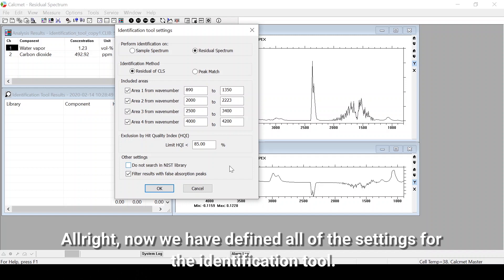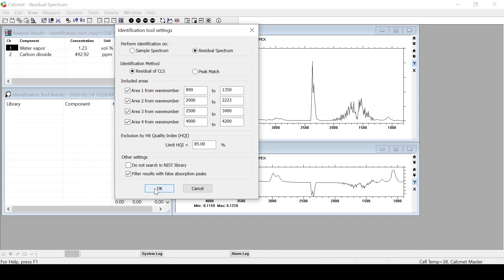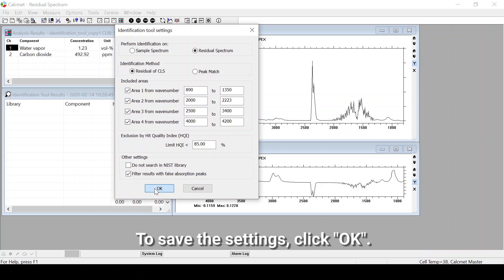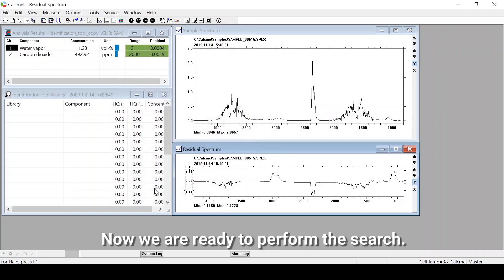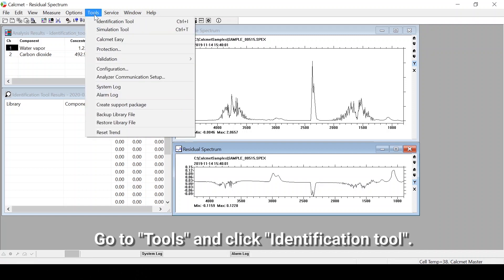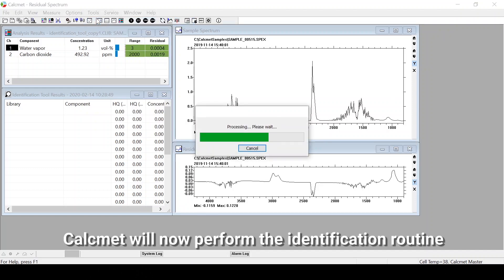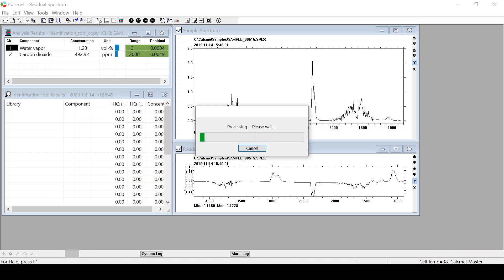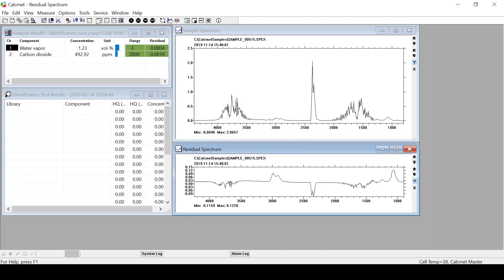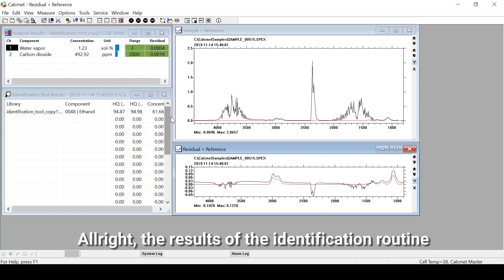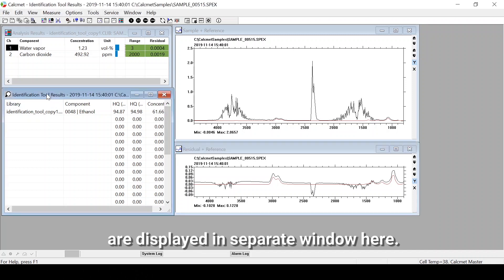Now we have defined all of the settings for the identification tool. To save the settings, click OK. Now we are ready to perform the search. Go to Tools and click Identification Tool. Calcmet will now perform the identification routine according to the settings we just defined. The results of the identification routine are displayed in a separate window.